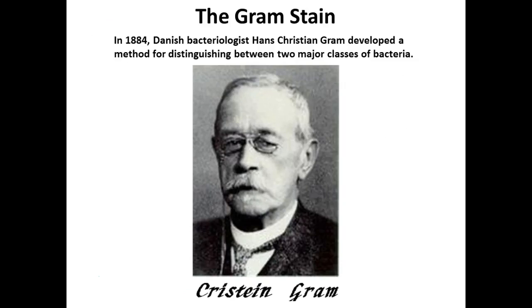So the gram stain that we do is actually named after a gentleman who came up with this procedure, and is widely used in microbiology because it helps us distinguish different types of bacteria. You can use it to stain other types of cells, but mainly we do this for bacteria because their cell wall composition and how it interacts with the dyes will give us the two different results, whether it's what we call a gram-positive or gram-negative result. And again, this is a result.